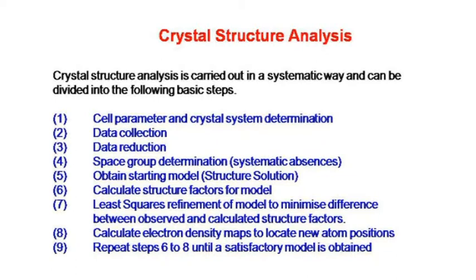At that point, you have to determine the space group. And yesterday we explained how you do that. You do that through systematic absences. And there are programs now that will do that automatically for you. They'll check your data and suggest a possible space group. But sometimes you have to do it by hand.